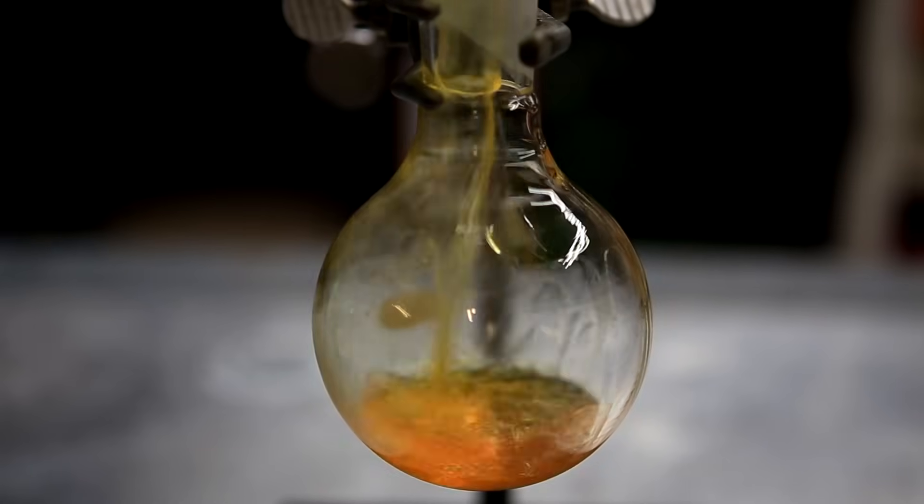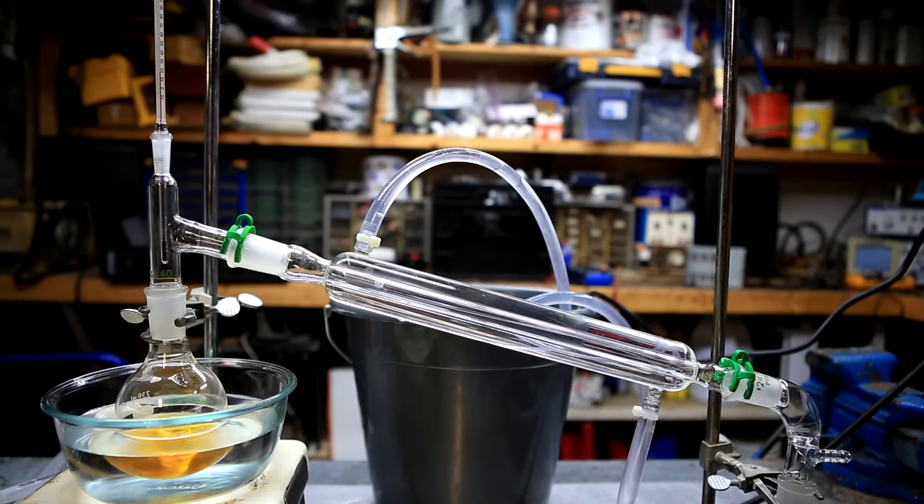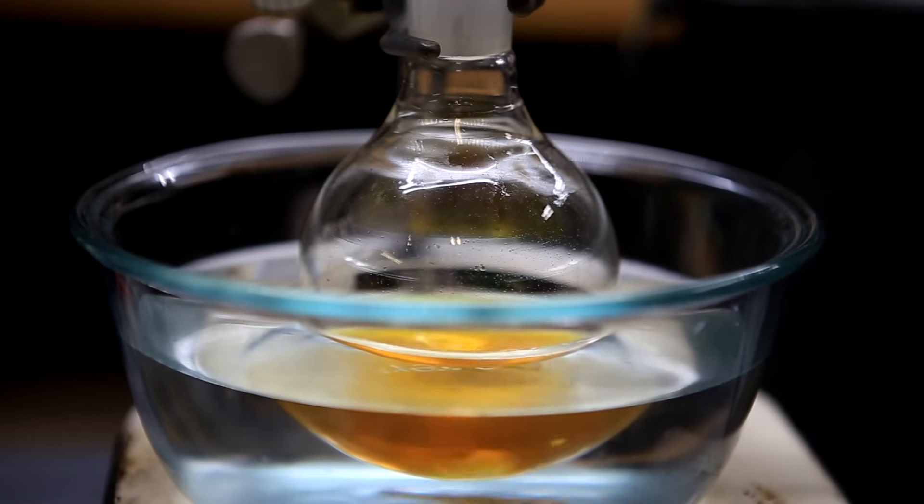This now much drier benzene is then transferred to a round bottom flask for distillation. A distillation is carried out to separate the benzene from the crude. The only fraction that came over was around 79 to 80 degrees celsius, which corresponds well to the boiling point of benzene.